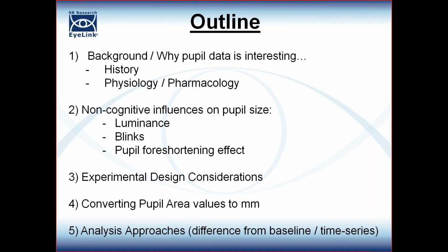Unlike the other webinars, which were more focused on practical aspects of things, looking at Experiment Builder and Data Viewer, this is more going to be a theoretical webinar covering the kinds of considerations you should bear in mind when doing pupillometry research, as well as some of the practical considerations for things like experimental design, and also some practical things like how to actually extract the pupil data itself, look at it and convert it to millimeters. And I'll cover at the end various analysis approaches.